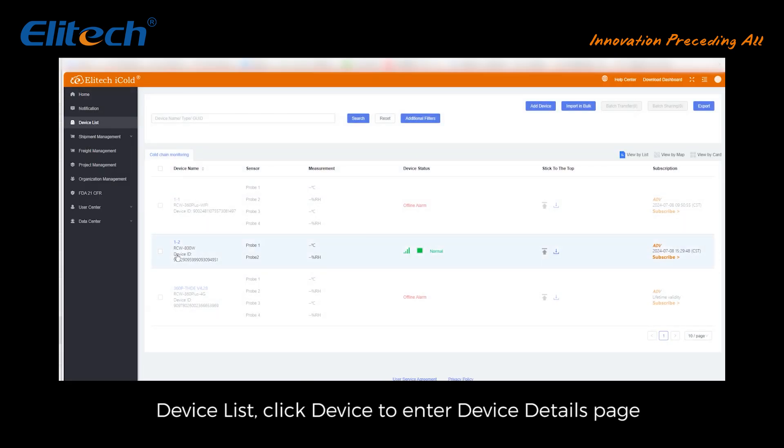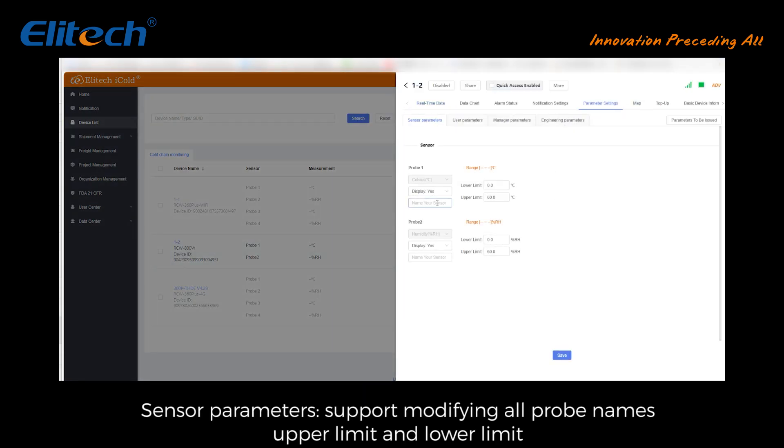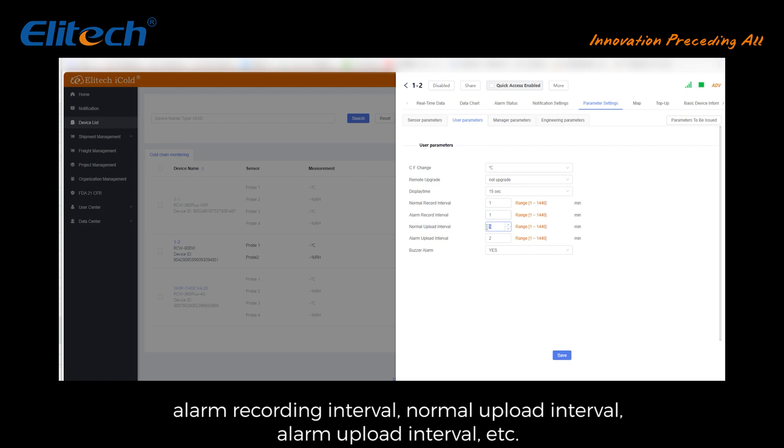Configuration and parameter settings: from the device list, click the device to enter the device details page, then click on parameter settings. Sensor parameters support modifying all probe names, upper limit, and lower limit. User parameters support modifying normal recording interval, alarm recording interval, normal upload interval, alarm upload interval, and other parameters.